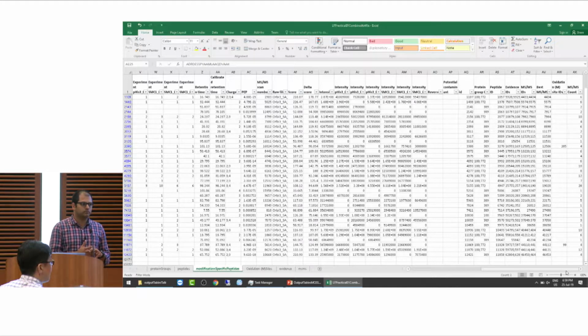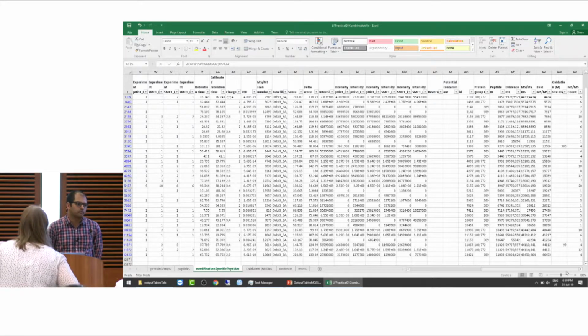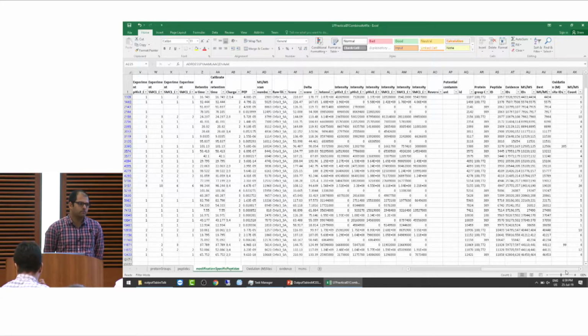But then do I use the intensity for, let's say, the entire protein group, like for the unmodified peptides as well? My question is, when a user comes and wants to look at the phosphoprotein in the global proteome setting, not enriched phosphoproteome, just wants to look at the modification as a first pass, I have the protein in the protein groups, and then I go to the phosphosite to only see intensity. So when I do the global proteome search, not phospho, just all the proteins, should I just take intensity or use LFQ in one case and intensity in another? For the proteome, you would use the LFQ if you have the LFQ, right?